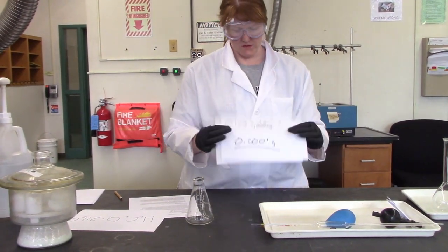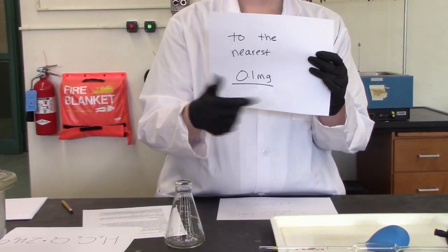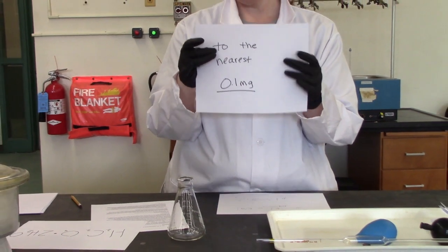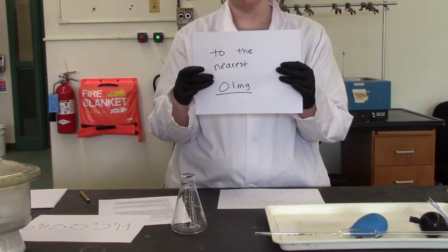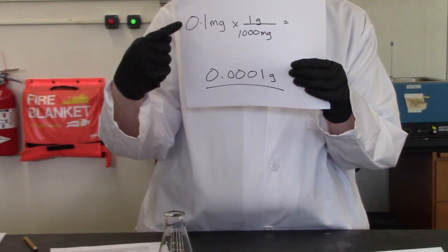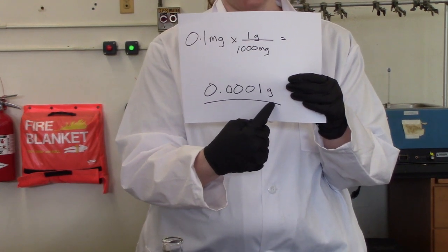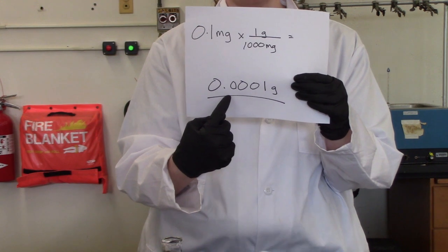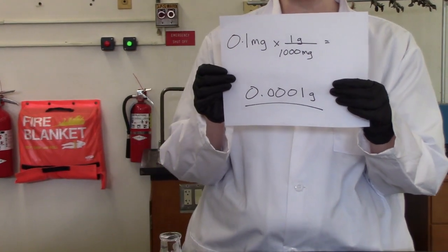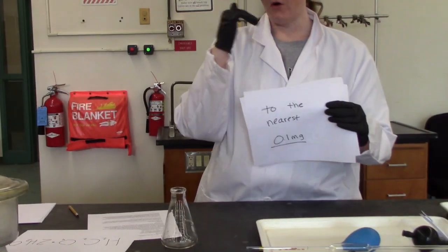So the next thing is which scales do we use? In the procedure, it says to measure to the nearest 0.1 milligram. We've seen this before: when something gives a number like that, that's a measurement of precision. It is not telling you to measure it in grams. When the precision is 0.1 milligrams, it means 4 decimal places in grams. All of your masses are recorded in grams in lab. All you're doing is making sure that you choose the balance that has 4 decimal places, not the one that has 2 decimal places. So that's going to be our analytical balances that are in the instrument rooms, not the top loaders that are in the lab. Make sure you pay attention to that. Write down all 4 decimal places.